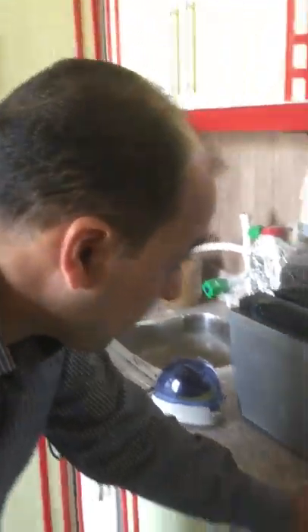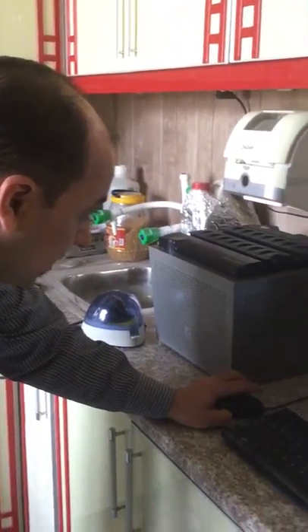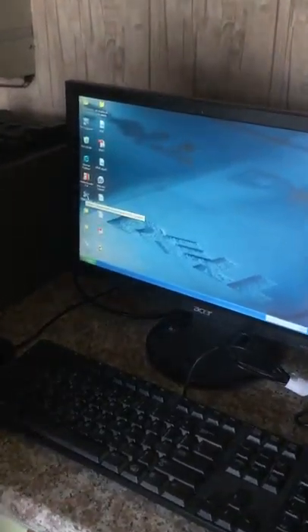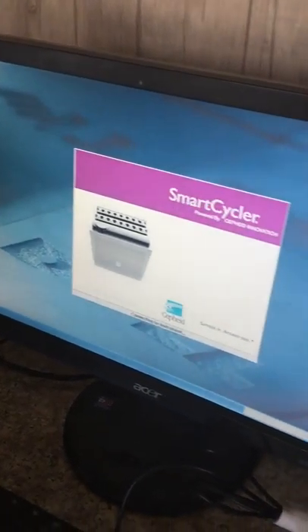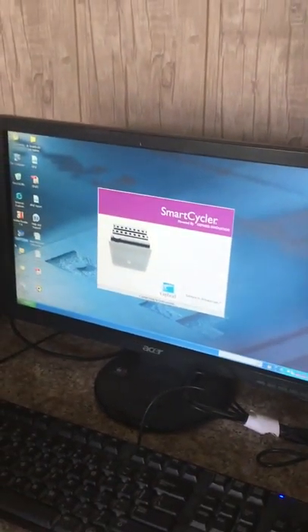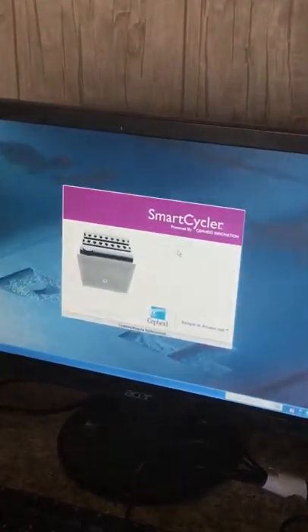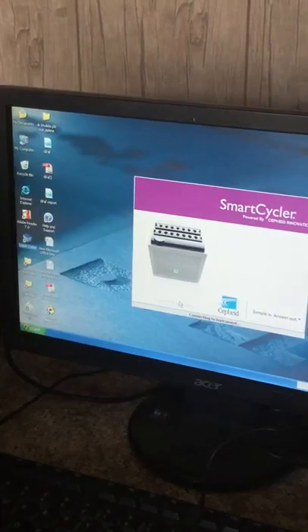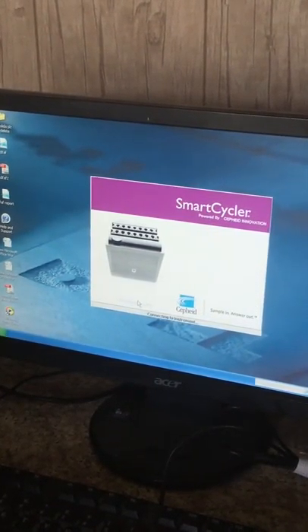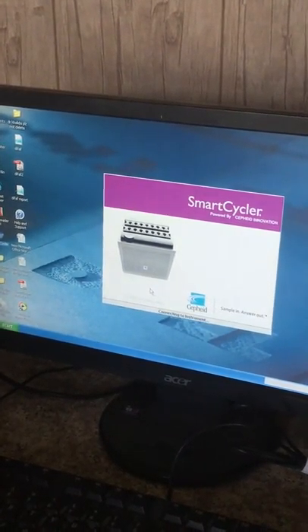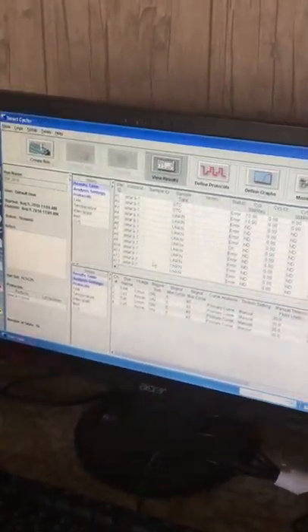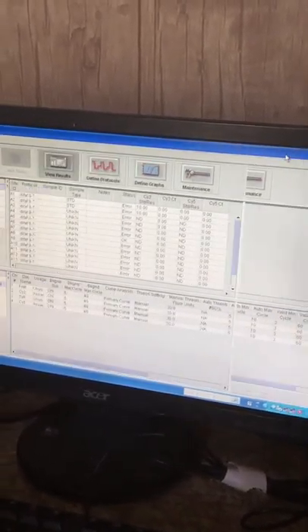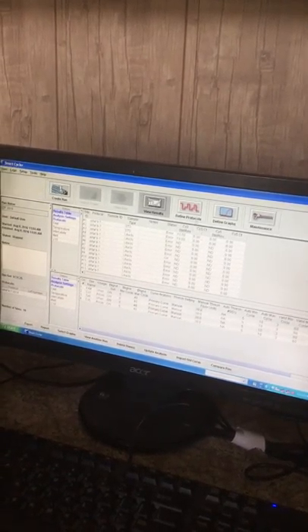Okay, first we'll be going to the icon of the instrument and double-click. This will be opening the windows relative to the instrument. This is the main window of the program. We should maximize the window.